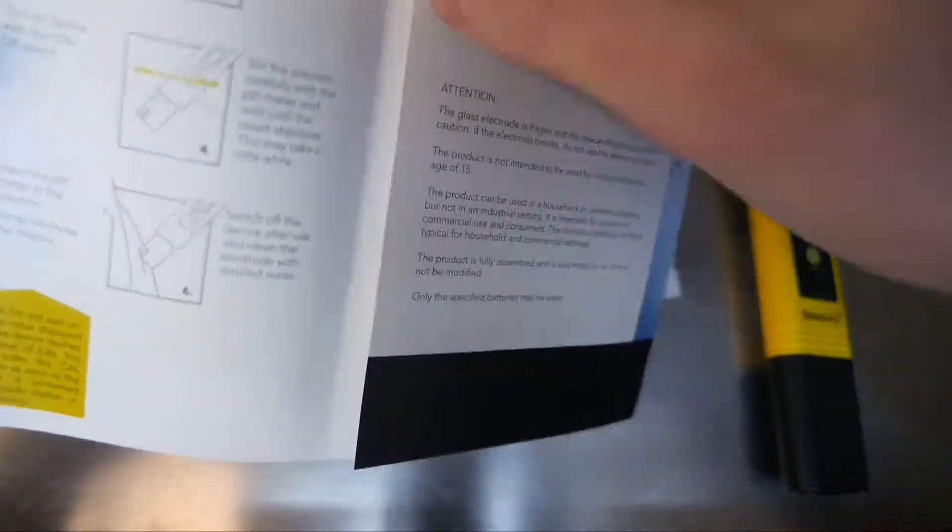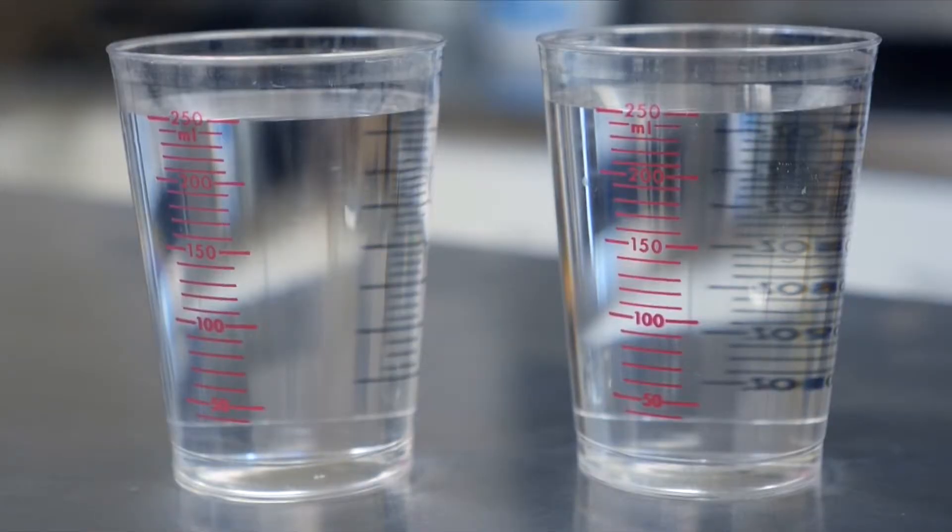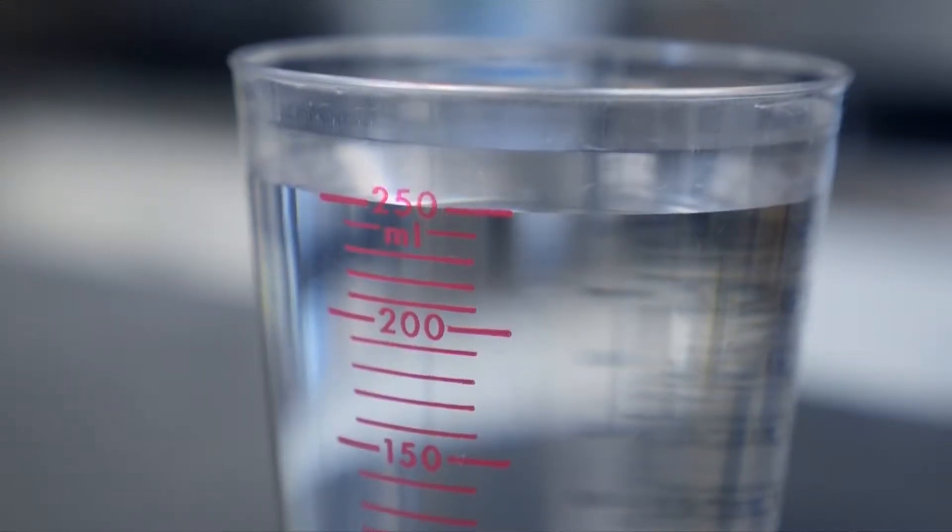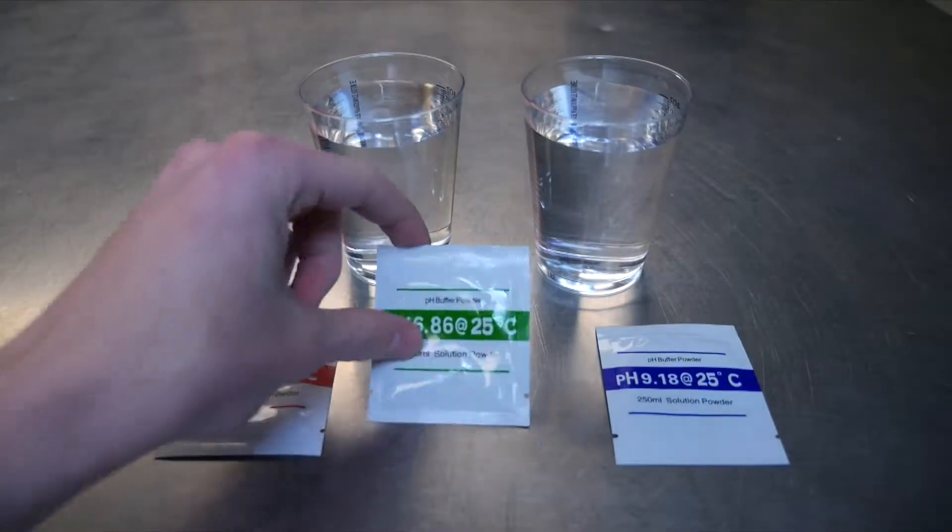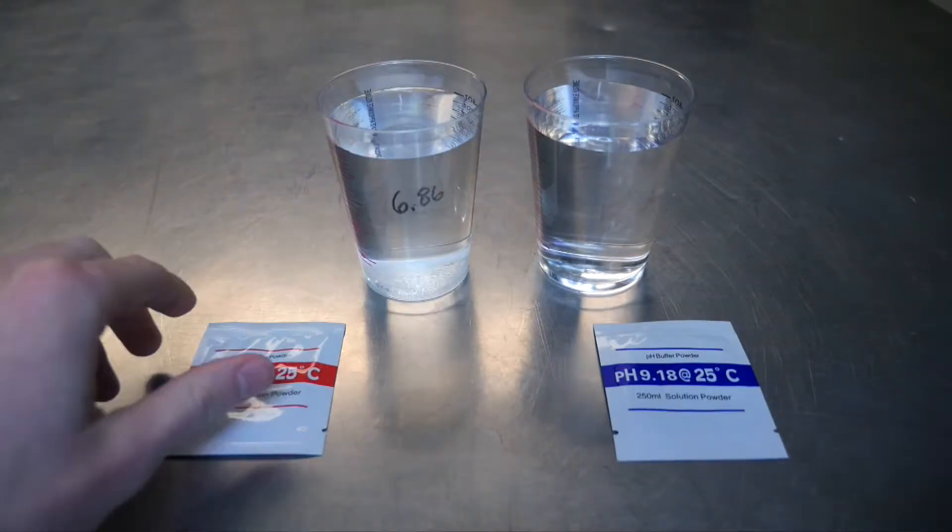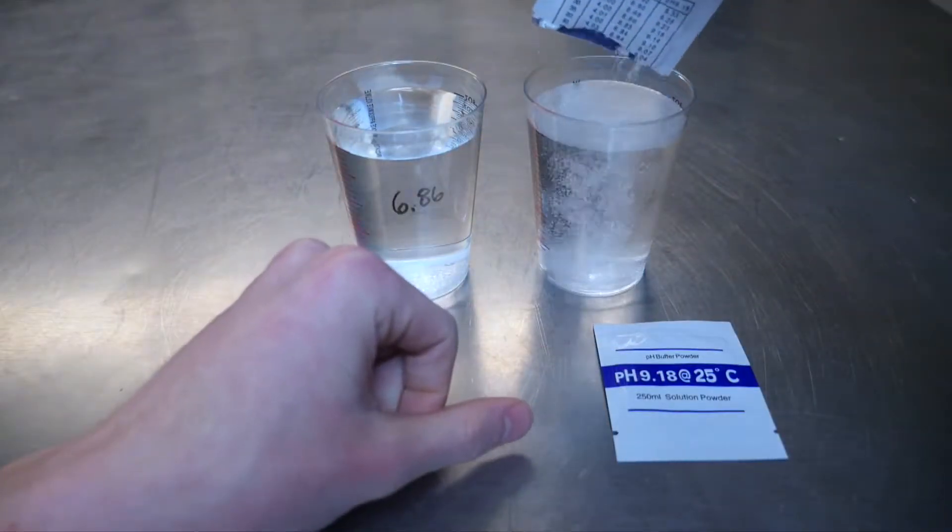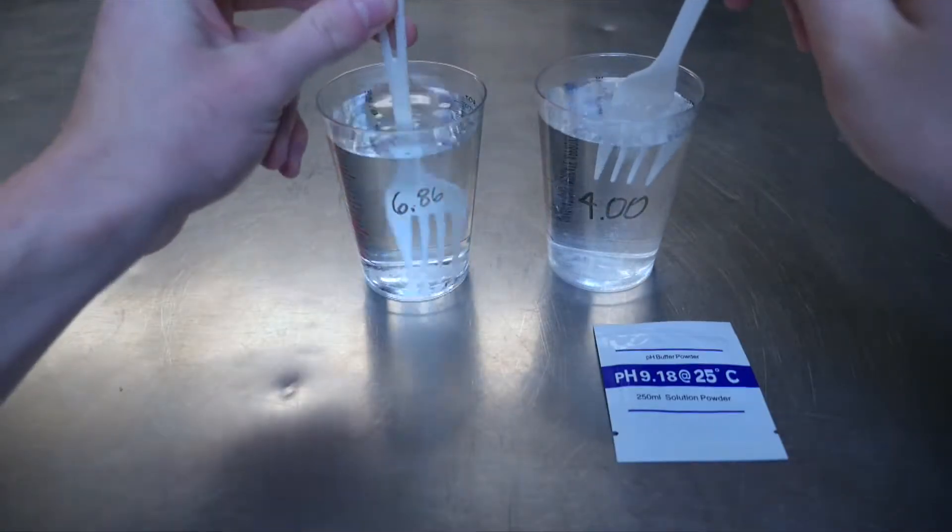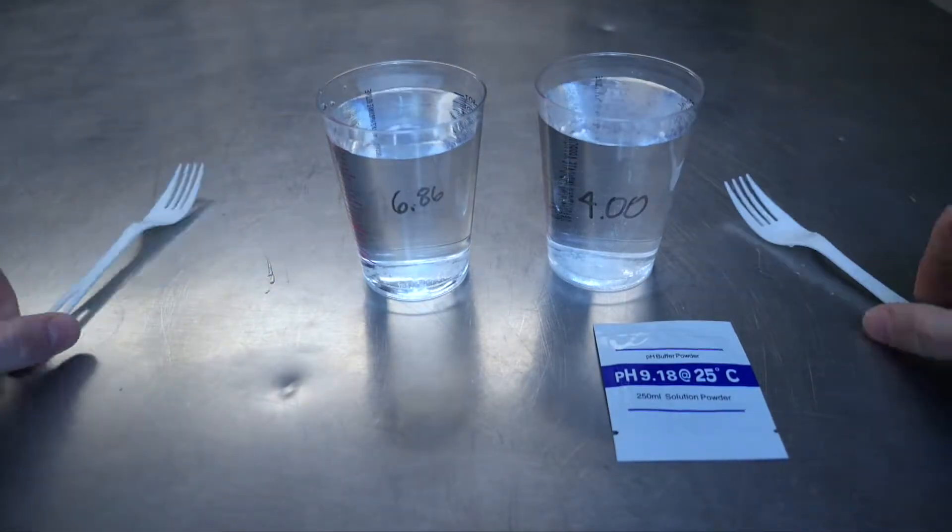Start by filling two glasses each with 250 milliliters of distilled water. Use the 6.86 and 4.0 calibration solutions by pouring each of them into their own glass. Stir both solutions using separate utensils until the powder fully dissolves.